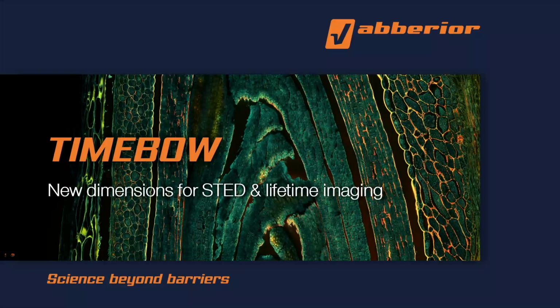And I think you brought along something as well? Yes, that's true. I brought living cells with me, and we will go for a session and have a look on multicolor STED imaging with these cells with our new TIMEBOW feature. So let's get started. If you have any questions, please write them in the chat function.